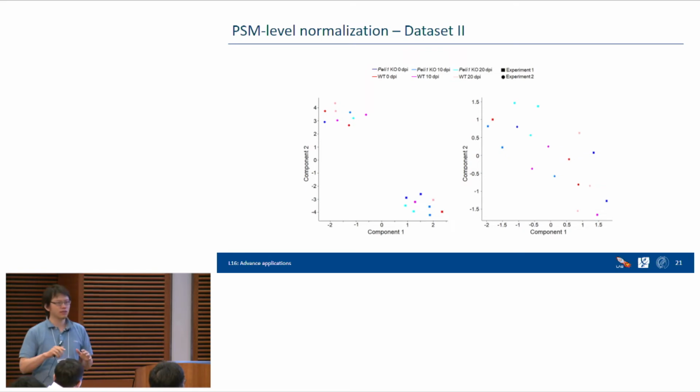And you can see that I didn't do anything to assign the batch information. Basically, if you use limma or use ComBat, you need to tell them which experiment or which sample, the column, and then the batch, like how to organize or the order of the batch. But here we didn't do anything about the batch information. It still works.